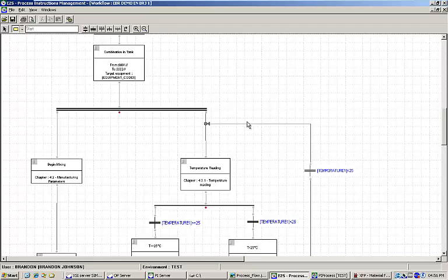After a work order has been launched, the associated EBR becomes available within the execution interface for operators to begin production.